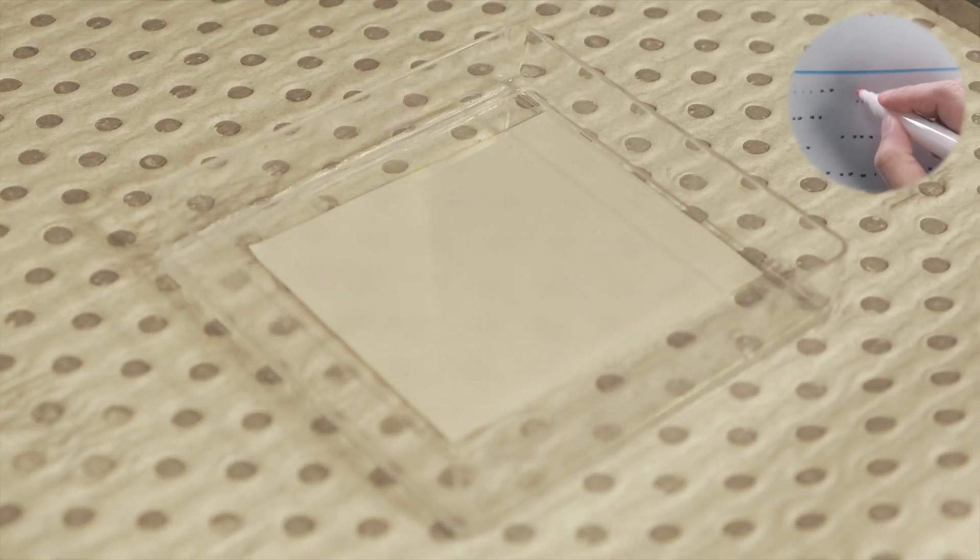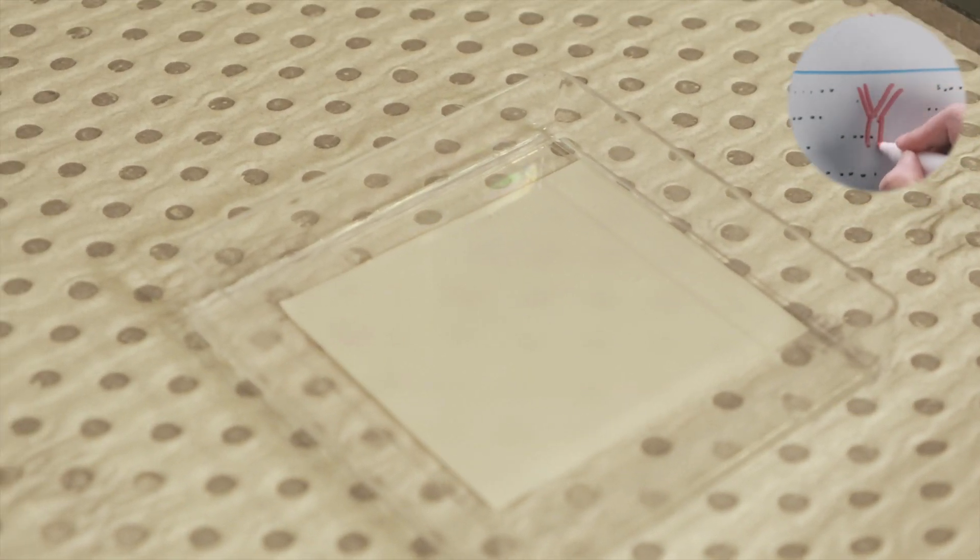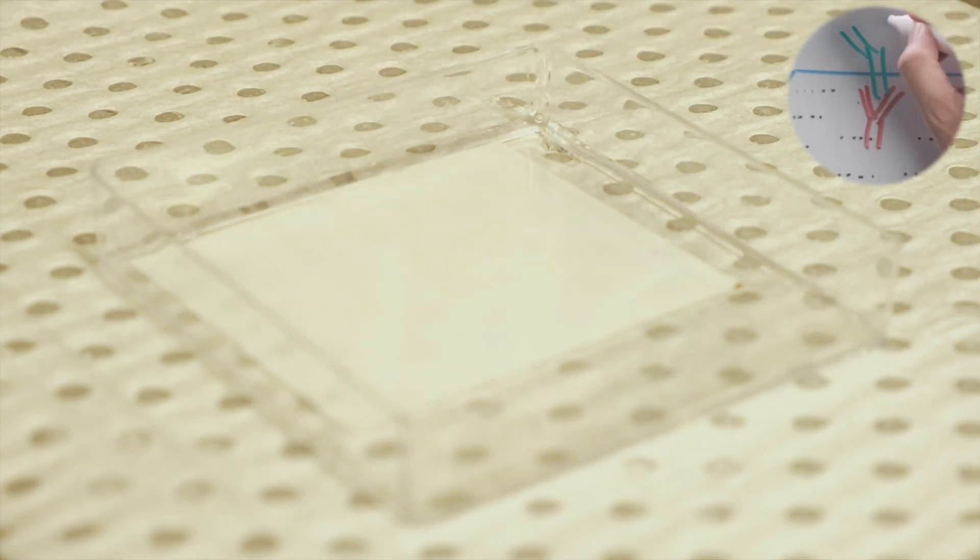The membrane is immersed in the solution containing the antibodies and allowed to incubate for up to an hour. Once the primary antibodies have finished binding, they are washed off and secondary antibodies are applied as before.